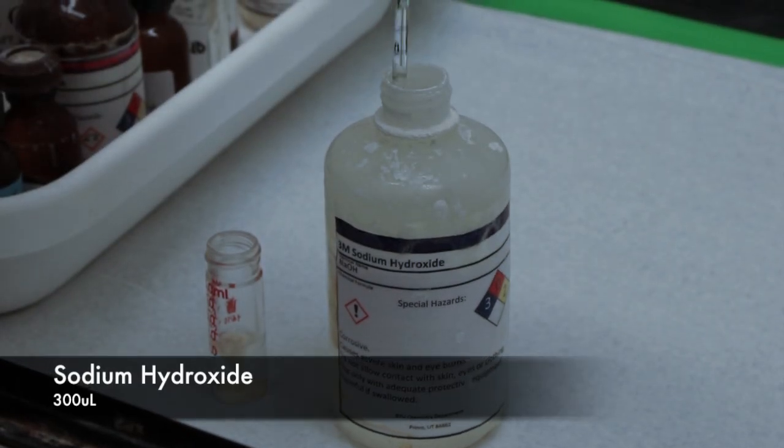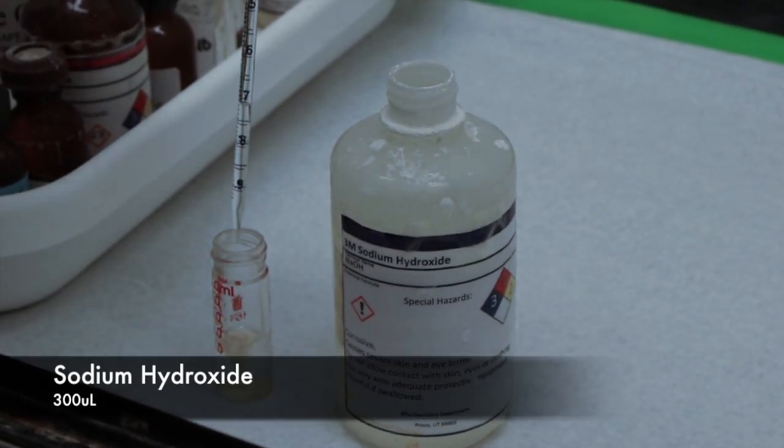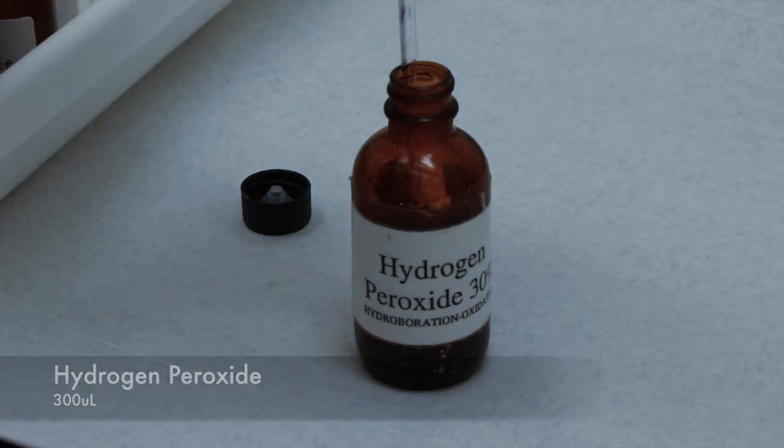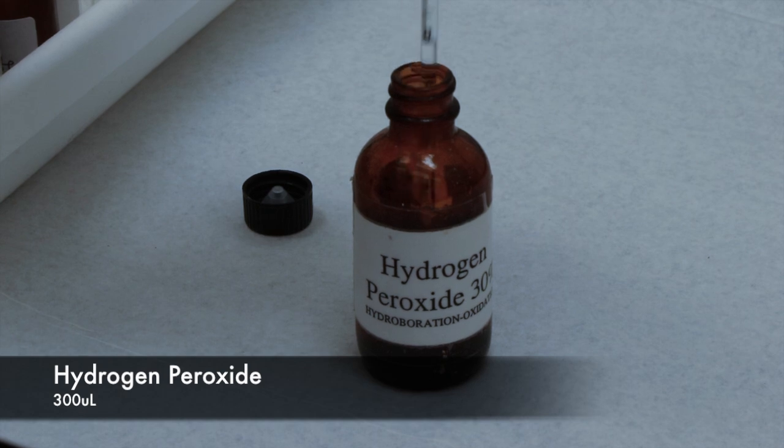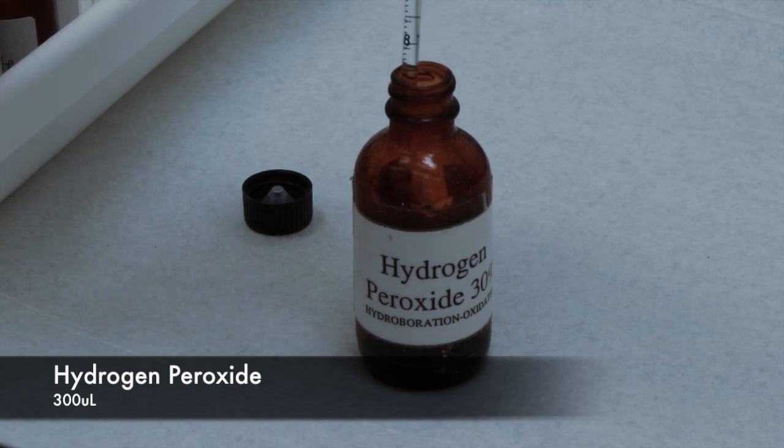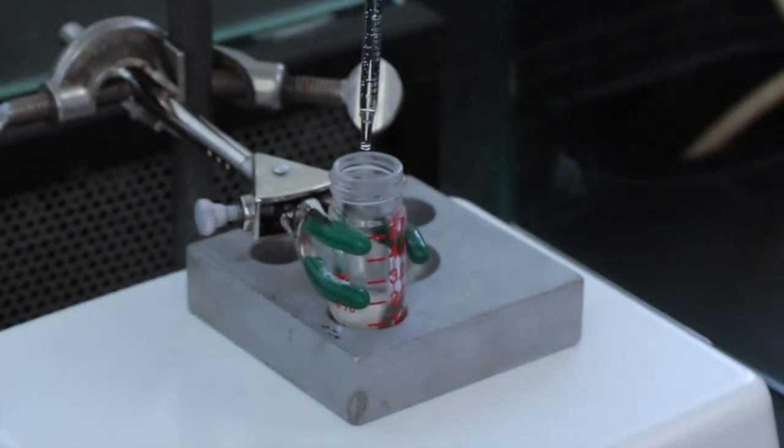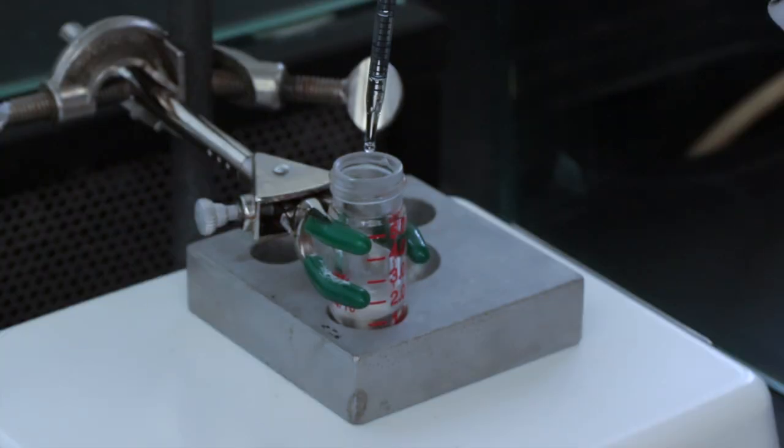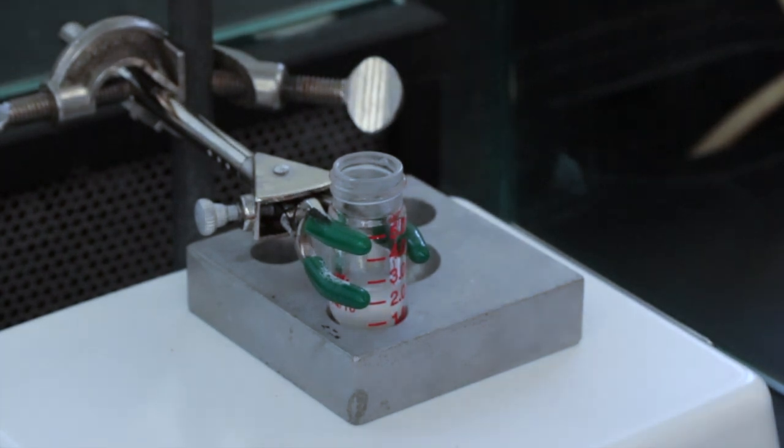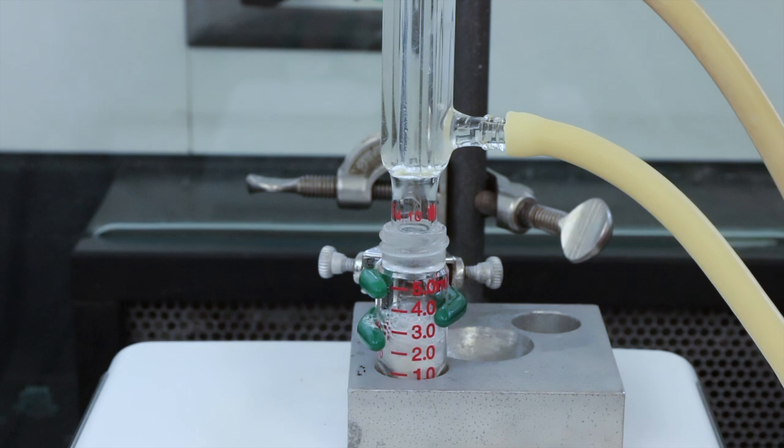Now we can move on to the oxidation step of this reaction. So I'll be adding the sodium hydroxide and the hydrogen peroxide. This is also very reactive so I'll be adding the hydrogen peroxide dropwise over a period of about 10 minutes. And we'll let that reflux for an hour now.